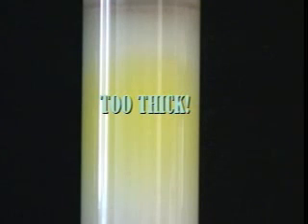One alternative to dry-loading is loading your sample as a solution in a solvent that is more polar than the solvent system you're using for your column. You will end up with a thick band of compound and poor separation.